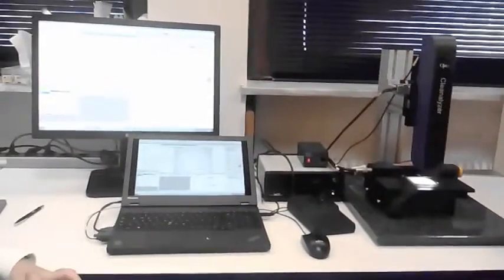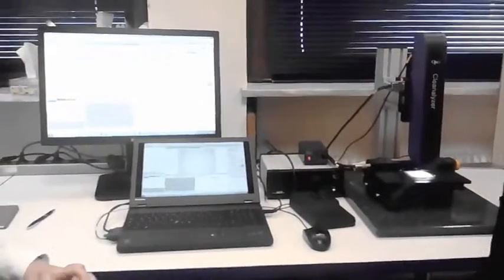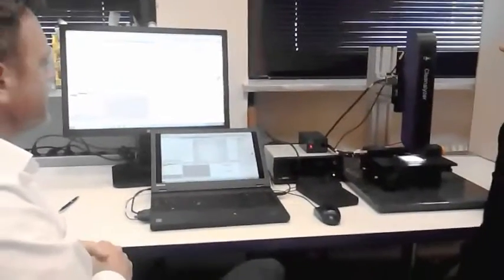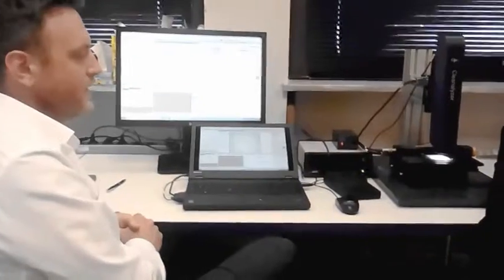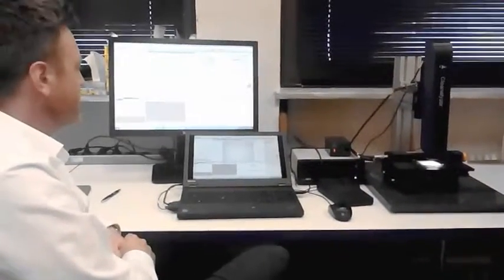So into the software, I will need help from my colleague Mr. Eman here. The software is designed to be really quite powerful. It allows a user to create their own standards of cleanliness or to be compliant with some of the industry standard specifications.